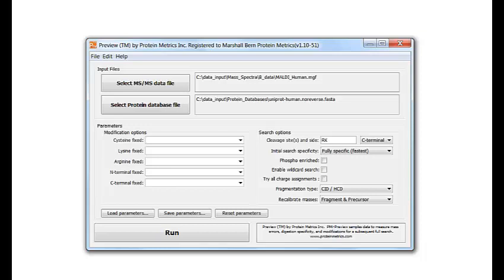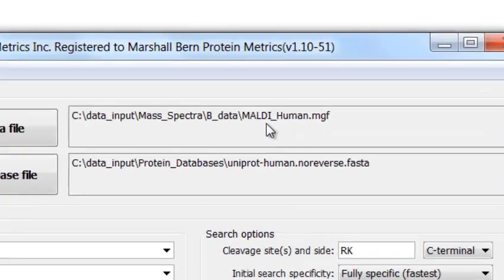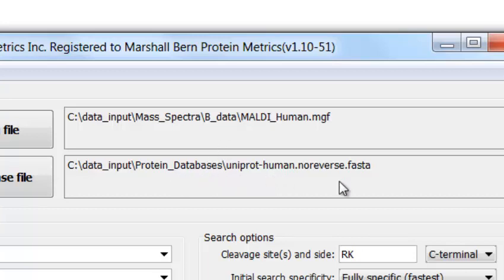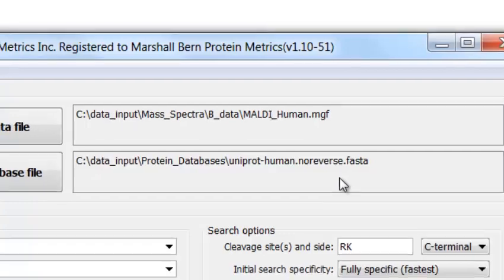Preview has two required inputs: a spectrum file here in MGF, MZXML, or raw format, and a protein database here in FASTA format.